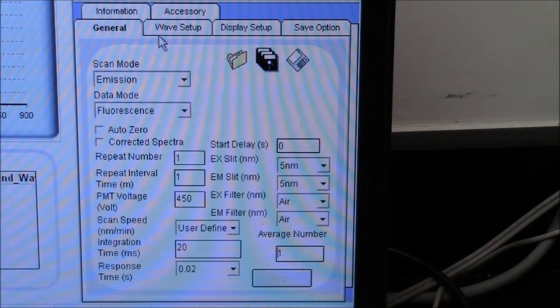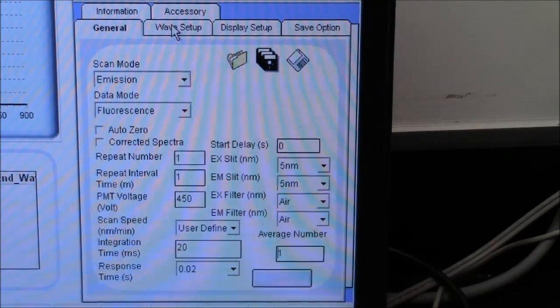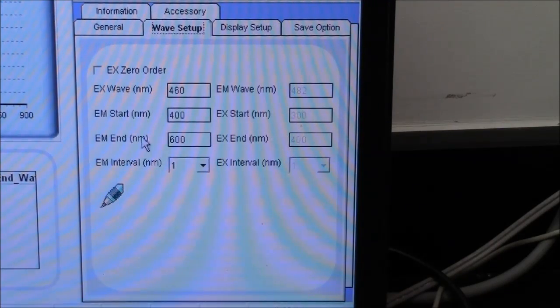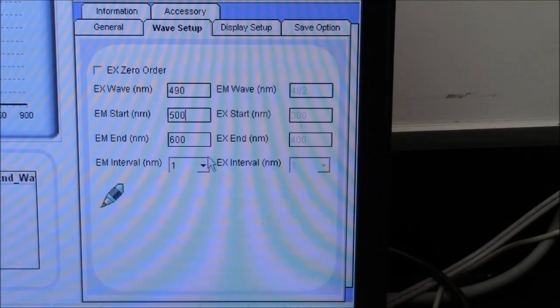Another important tab to click on is this wave setup, because I need to tell the machine what my excitation frequency is and what wavelengths I want to scan. For fluorescein, the recommended excitation wavelength is 490 nanometers, and I will collect a spectrum looking at the fluorescence from 500 to 600 nanometers. That looks fine. It's going to look at every nanometer between 500 and 600.